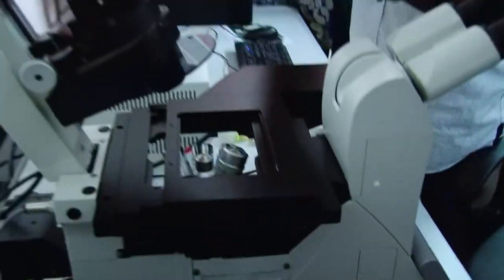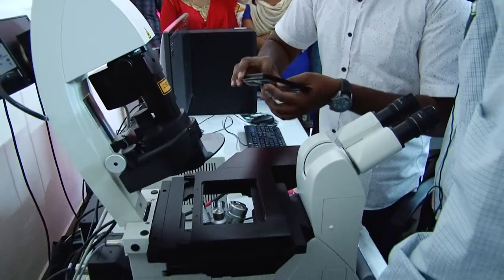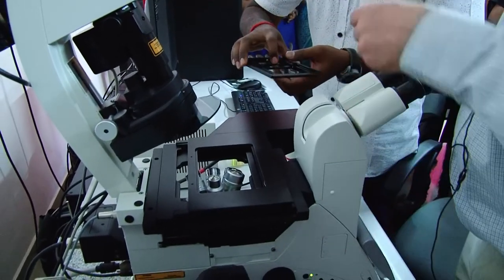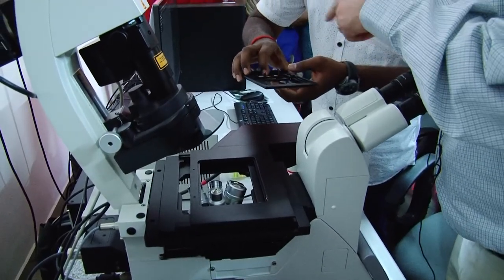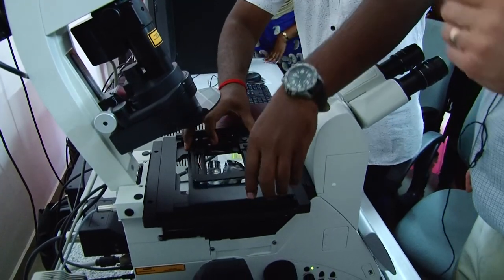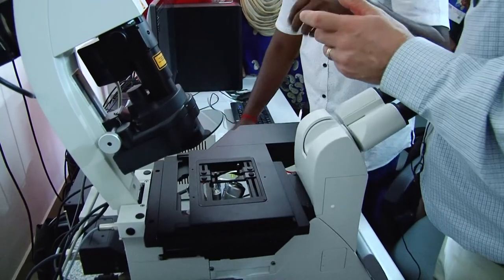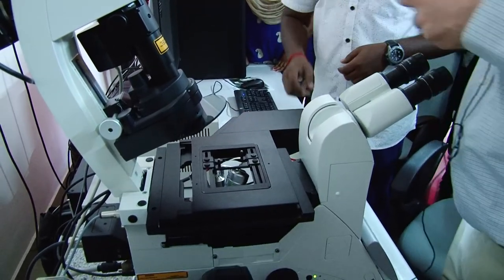Then what we'll try to do is find some, yeah, the pollen grain, exactly. Then we'll see if we can do some stacks, and then we'll let them sit down, look at it, and shoot some stacks. That'll be the plan. So we get it to work once, then we'll get it to work 51 times.